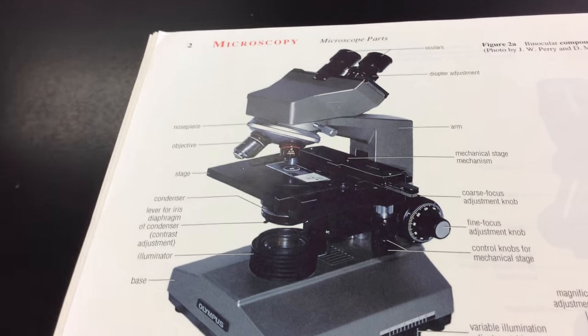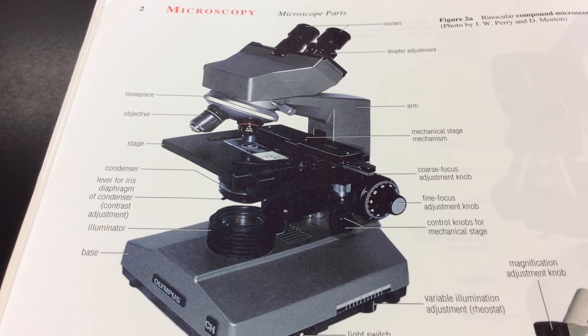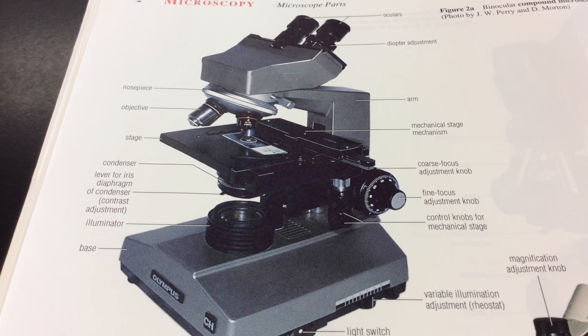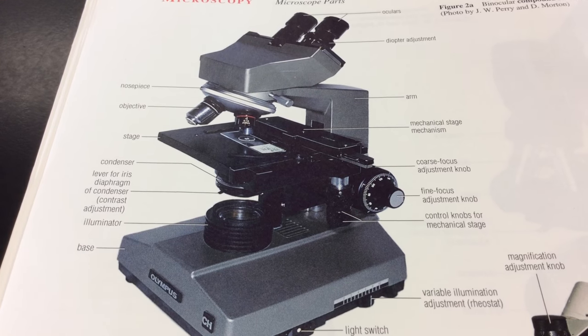All right. So what we'll next do is take a look at a labeled photo from the photo atlas, so we can just briefly go over the parts of the microscope, and it will be important that we can identify the different parts of our microscope and what their function is. Okay, so we'll use this labeled photo. And so here we can see much fancier than our little compound microscope, consisting of two lenses and a tube. So we'll just work from top to bottom.